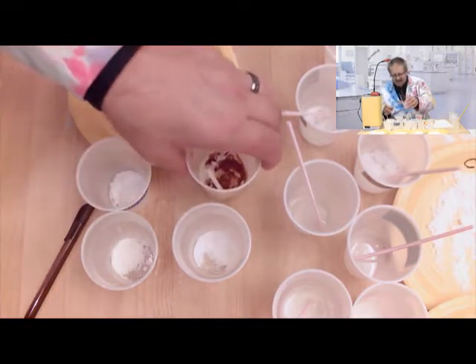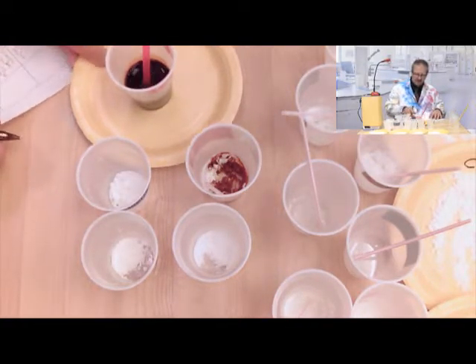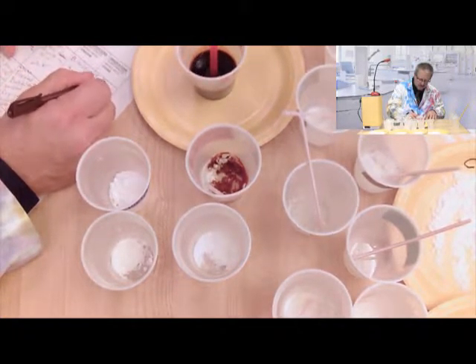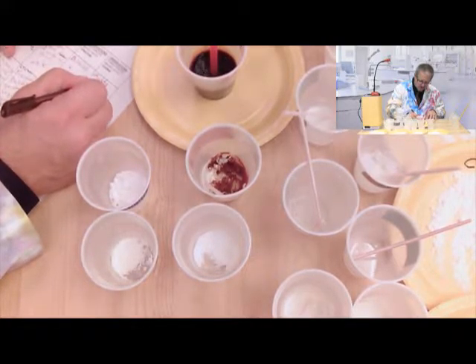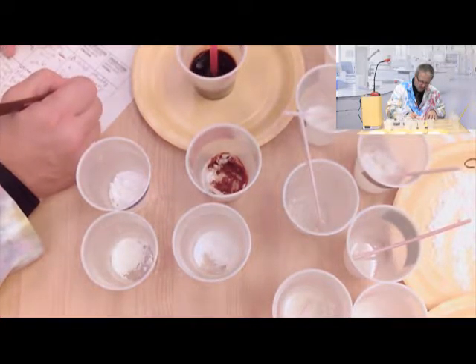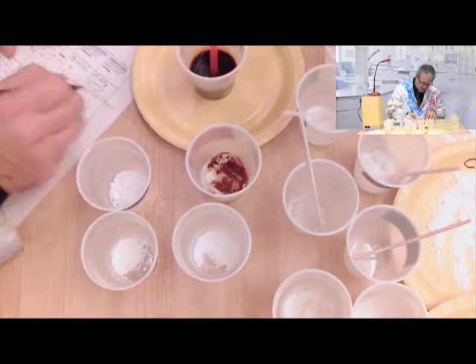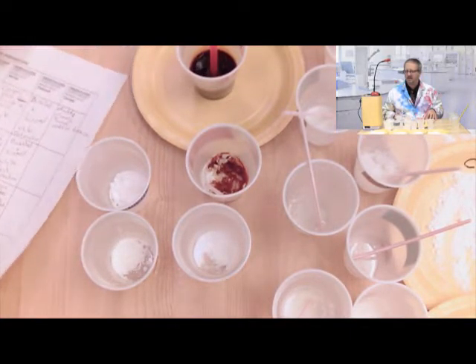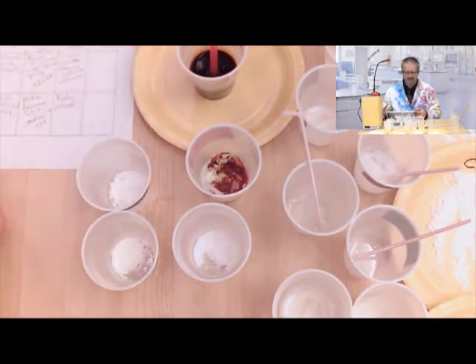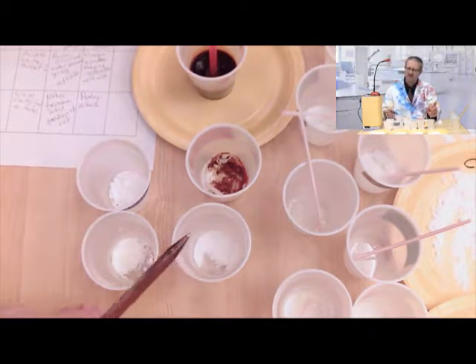Got muddy, clumpy. So for A, it's muddy, clumpy, turned reddish brown. Okay, don't know if you can see that or not. Muddy, clumpy, turned reddish brown. Okay, let's try B, which is this one here.